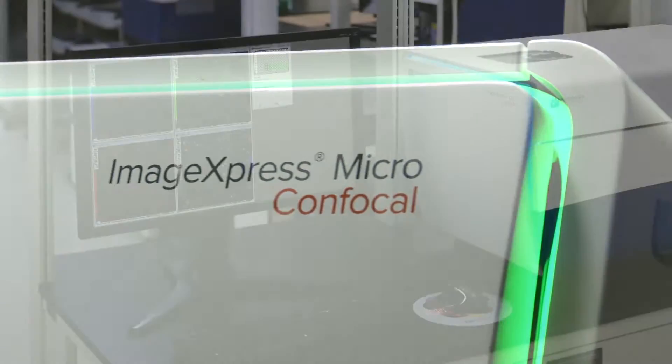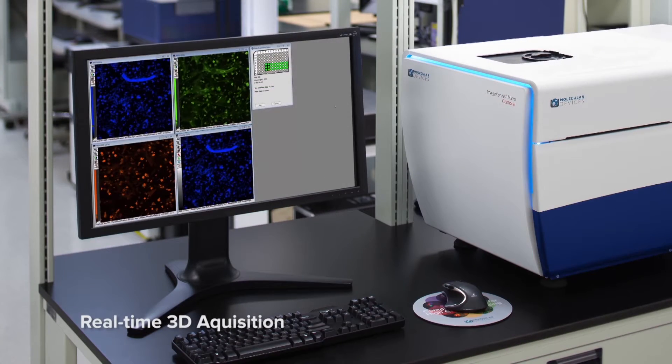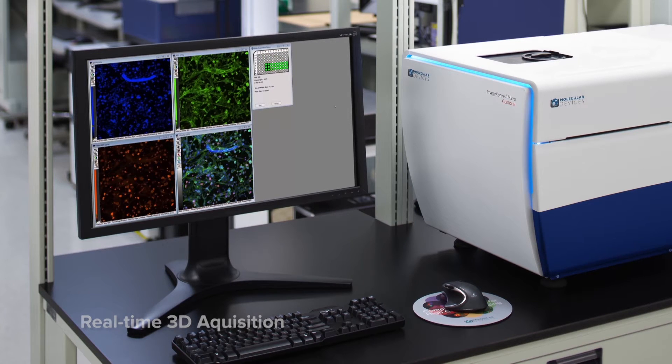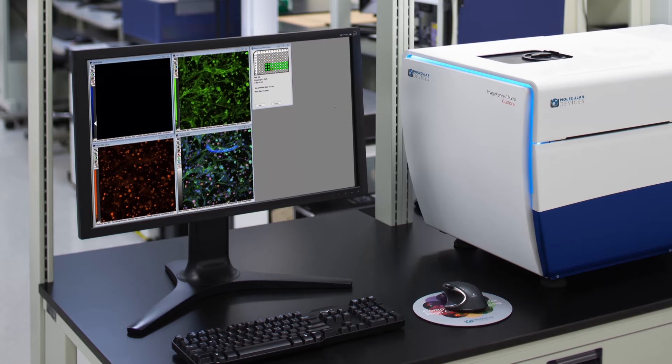The ImageExpress Micro-Confocal System is built for screening, providing you more quantitative and statistically relevant results with complex cell models at a speed you'd only expect from a wide field system.